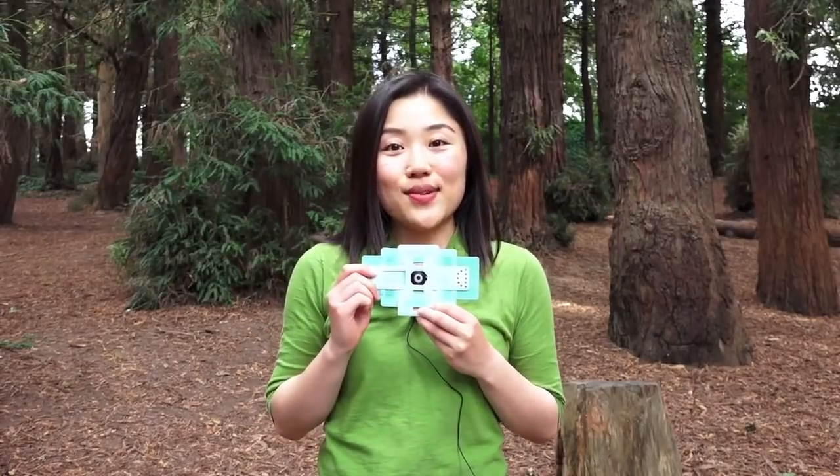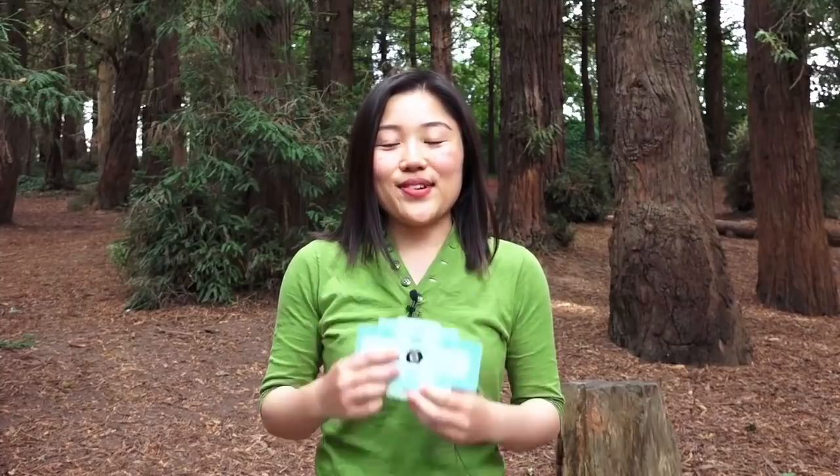Hello, my name is Honomi. I'm the Director of Community Engagement at Foldscope Instruments. Today, I'm joining you from beautiful Golden Gate Park in San Francisco, California. In this video, I'm going to share with you how to assemble your brand new Foldscope. First, we'll show you all the pieces you need to assemble your Foldscope, and then we'll assemble one together. Let's get started.